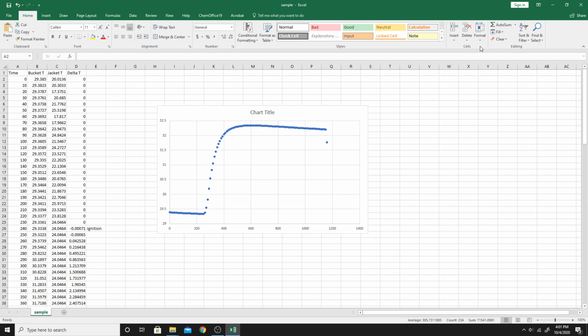If you use the mouse to move along the plot, you can find that the time before the temperature rises is 250. Before this time the temperature hasn't risen yet. After 250 you can see the temperature start to rise. So write this time down, 250, and in this data file we choose from 0 to 250, which should be before the temperature change. Let's plot again.